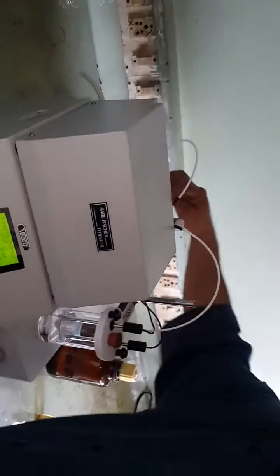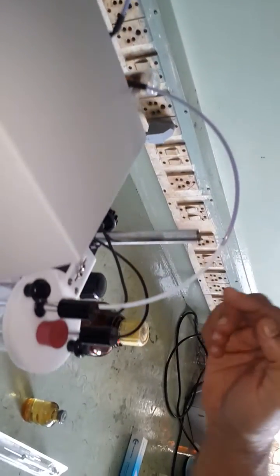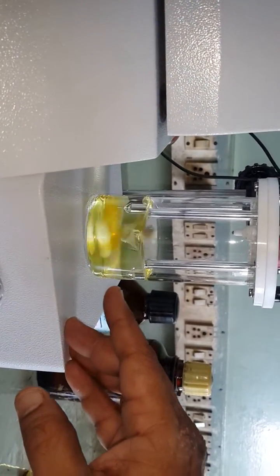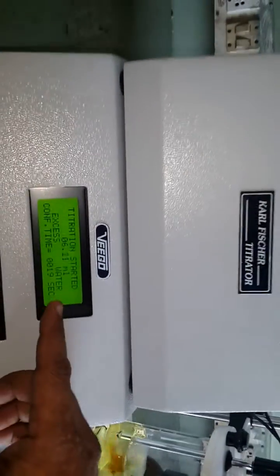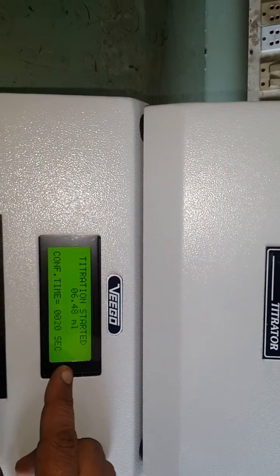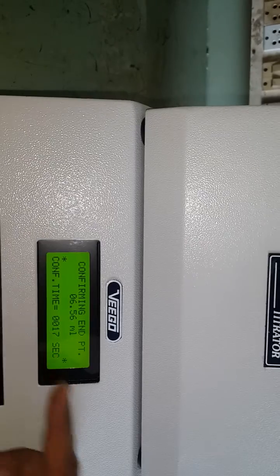You will see the reagent being sucked into the pump and then added to the titration vessel. The display shows the volume of reagent being added. Observe that the excess water signal is on and the reagent is being added. When no water is detected, the excess water signal will go off momentarily and the confirmation time starts counting from 20 towards zero.